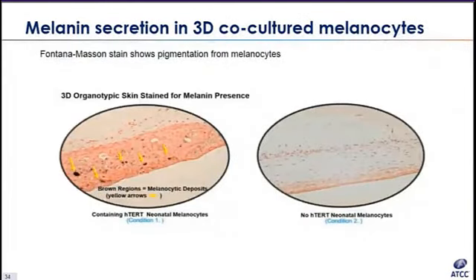The first model had all three cell types: hTERT immortalized fibroblasts, keratinocytes, and melanocytes. The other model only had fibroblasts and keratinocytes. This was done so that one could clearly see that melanogenesis had occurred due to the presence of melanin in condition 1, as shown by the yellow arrows pointing out the deposits of melanin.